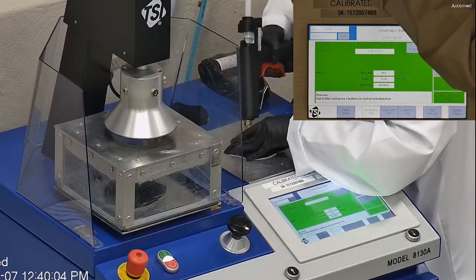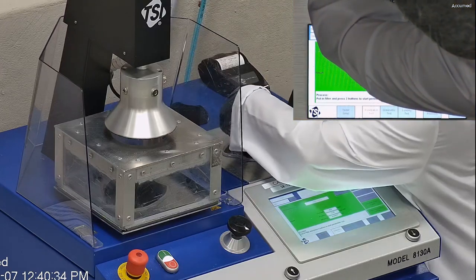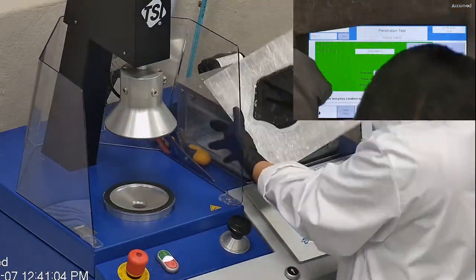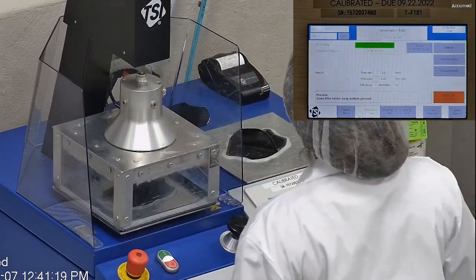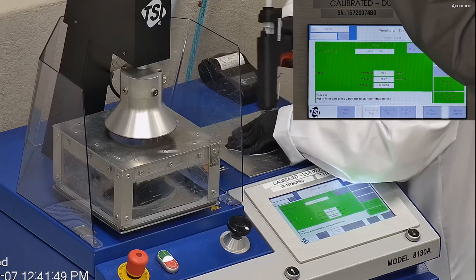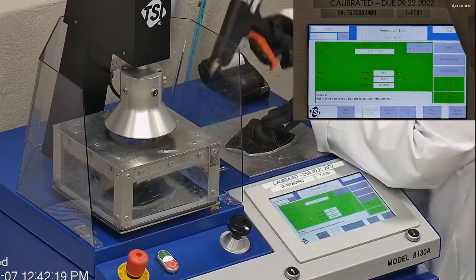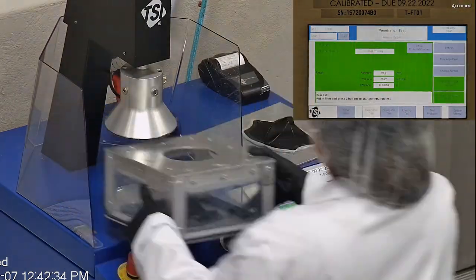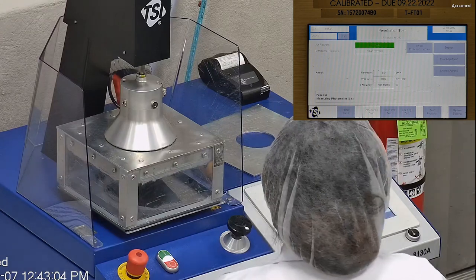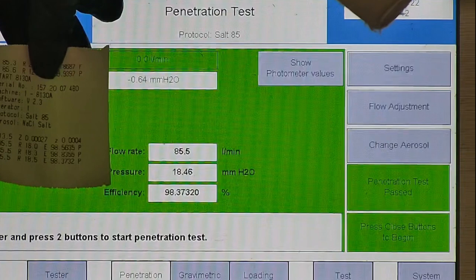We make sure that the mask is completely sealed with hot glue to the testing plate. The testing plate is attached to the frame, and the box is placed under the TSI filter holder for testing. Let's go over the results. F stands for air flow rate, which we test at 85 liters per minute.